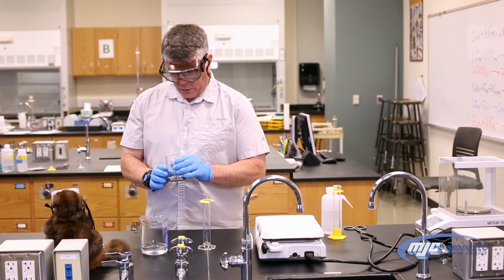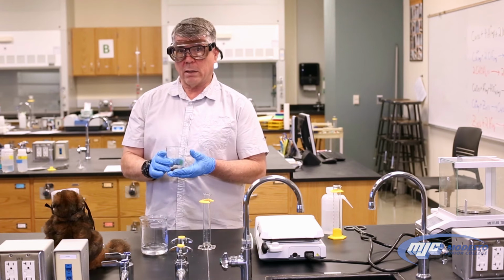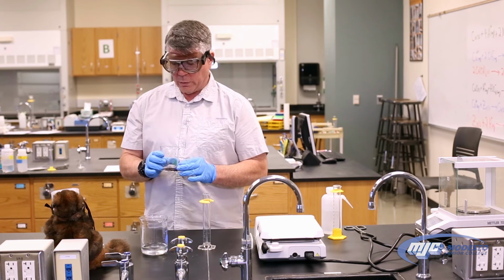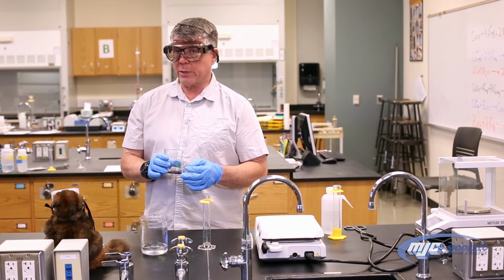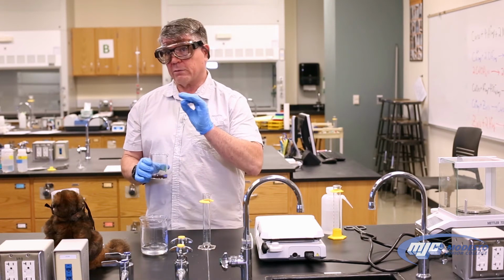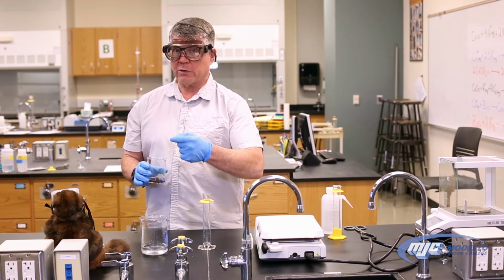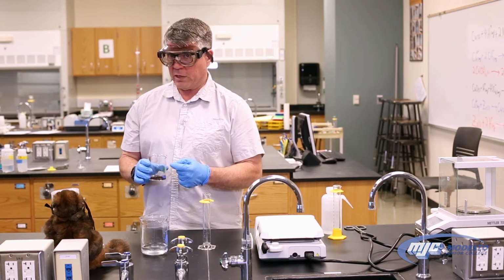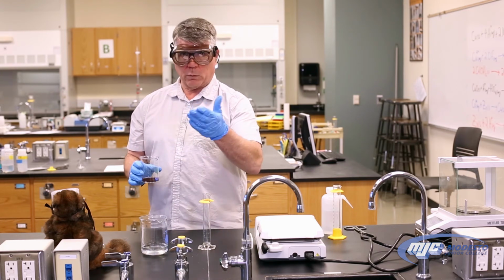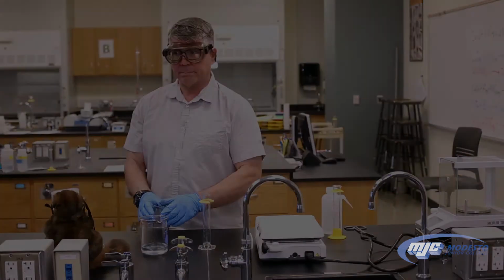Okay, so now there still is some zinc in there. In the end, we're going to dry this stuff, and over the week, come back and weigh it the following week. So we want to make sure that we just have copper in there and nothing else, which means that the zinc that's probably still in there, we want to get rid of. So that's the next step we're going to do: go back to the fume hood, add some concentrated hydrochloric acid. That will react with the zinc metal, producing hydrogen gas and dissolving it, and then we can wash that off of the copper. So let's go back over to the hood and do that.